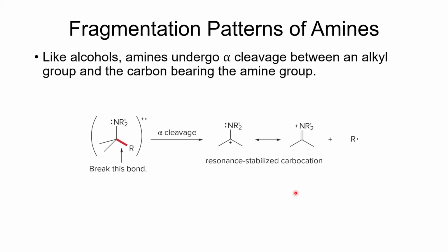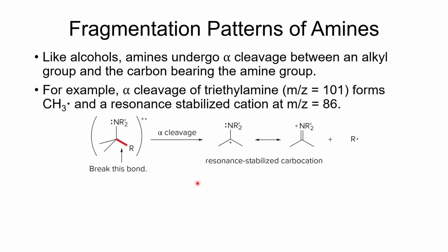All right. For amines, you get something that's very similar to what happens with alcohols. You get the alpha cleavage. We get a breaking of the bond between the carbon with the nitrogen and the alpha carbon, and when that happens, we get this resonance stabilized carbocation.